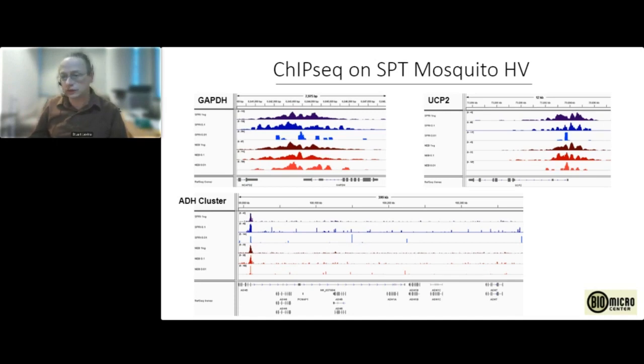The last gene to show you is the alcohol dehydrogenase cluster. The ADH cluster is active mostly in the liver, but the ADH5 gene is constitutive, and we can see that here. So this is on in embryonic stem cells. And across the rest of this cluster, we expect to see silence.